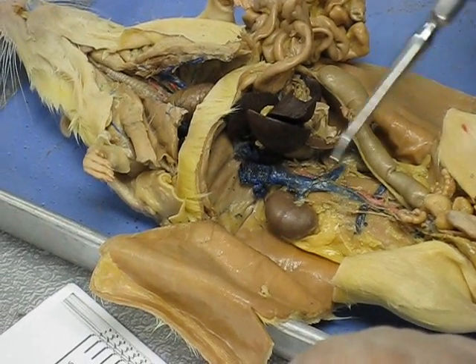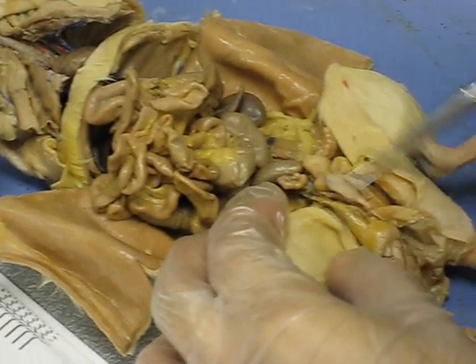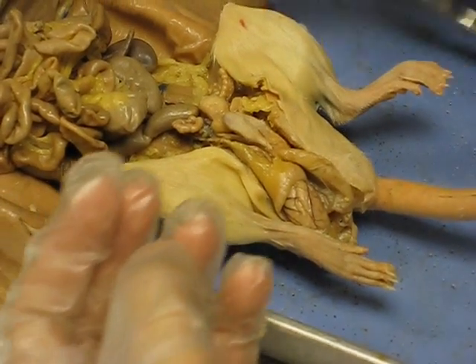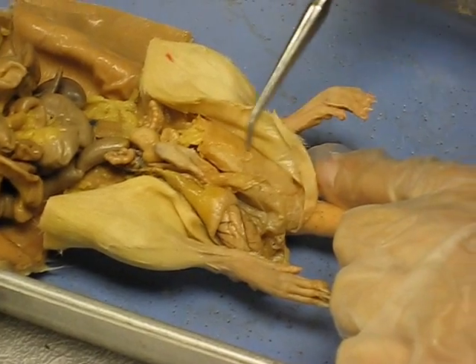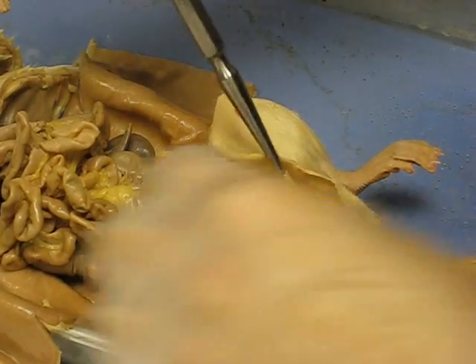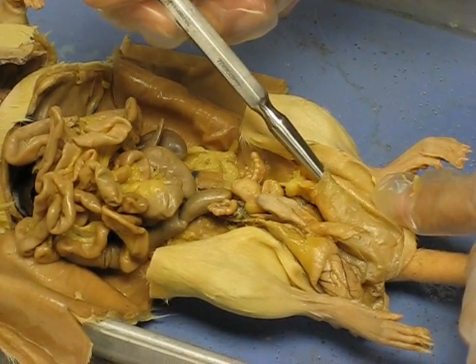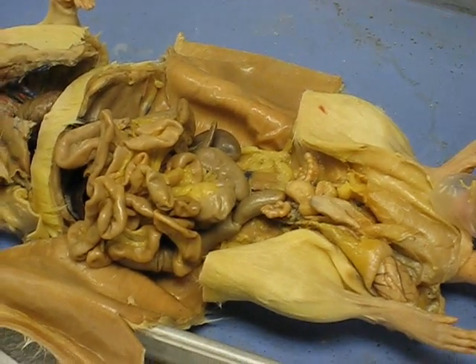The ureter isn't injected with latex, so you'll know it's not a vessel. It's going to lead from the kidney straight down — pretty straightforward. Okay, so now we go down into the male urogenital system. Before you cut him open you saw the scrotum. Within the scrotum is another pouch-like area — this is the cremasteric pouch. Within the cremasteric pouch you find the testicle. The cremasteric pouch surrounds a cavity known as the vaginal cavity.